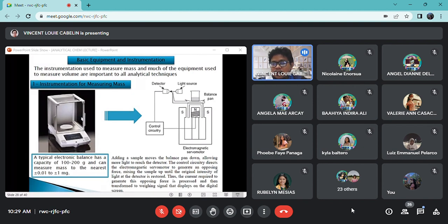Now, what's crucial in an electronic balance is its ability to tare the measurement, to have a tare. Tare na pag nilagay mo, for example, mag-measure ka ng 5 grams of salt. Siyempre, saan mo siya i-measure? You will not put your salt directly on the pan of the weighing scale, so you have to use a particular container, right? Like a small beaker, or a paper container.